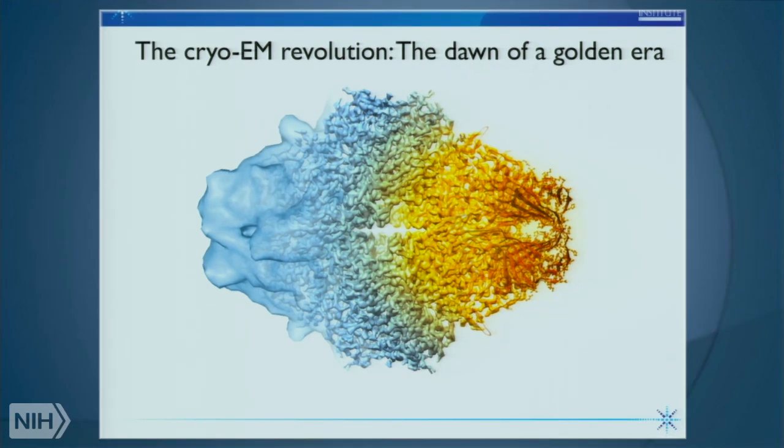Anyway, to summarize, the cryo-EM revolution is here. It certainly is a golden era in structural biology, but I think its real value is in providing insights into mechanism and especially structural aspects that might not be possible by the other very powerful methods, crystallography and NMR. Looking into the future, clearly it will become an important tool in addition to all the ones that we have.